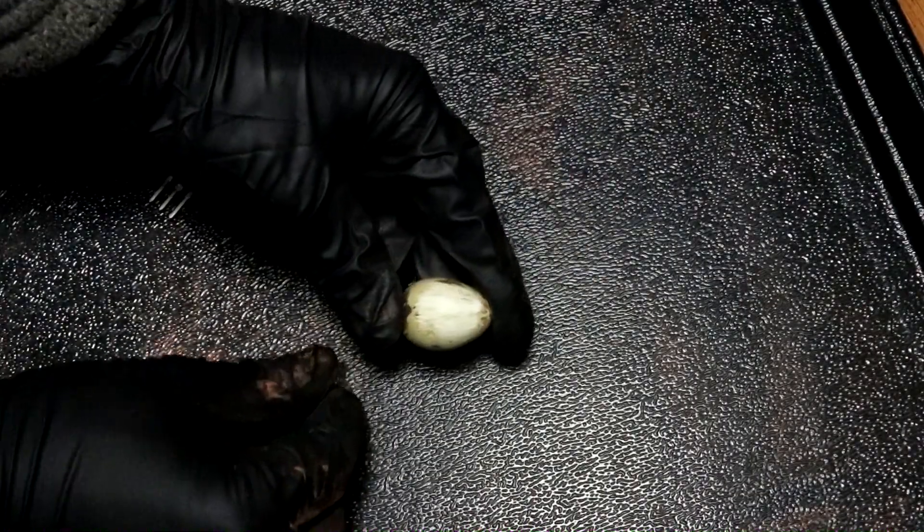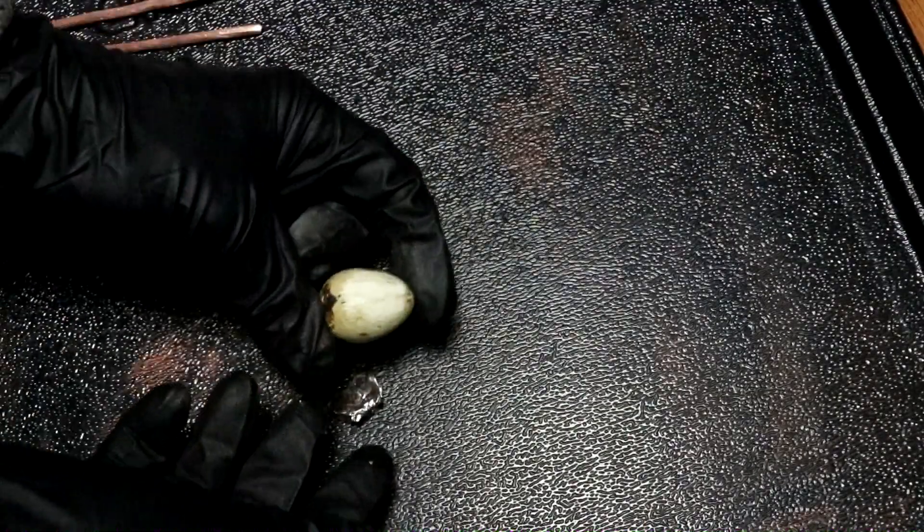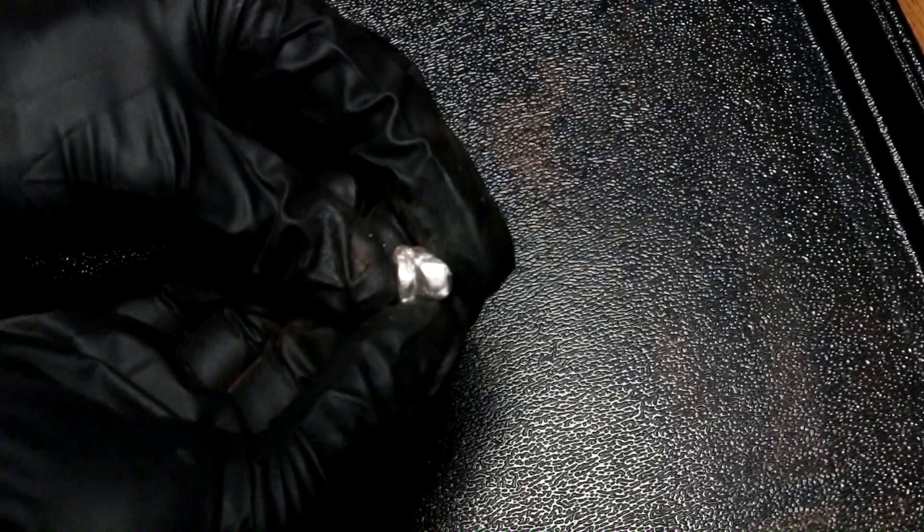Testing whether the rough surface of the egg will adhere to the amalgam — it doesn't look like it's going to work as a conductive paint. Maybe with a thicker layer smeared into a thin sheet, but it's not going to do what I wanted. It goes a more whitish color when compressed, kind of like squeezing wet sand.